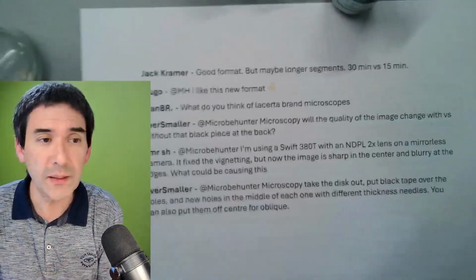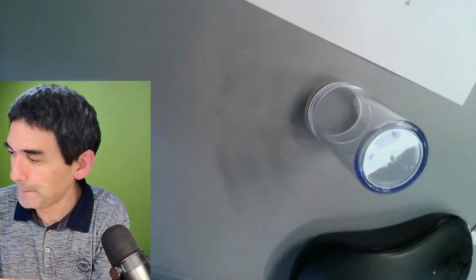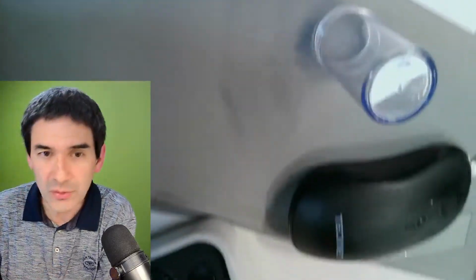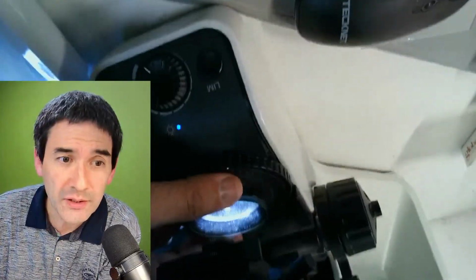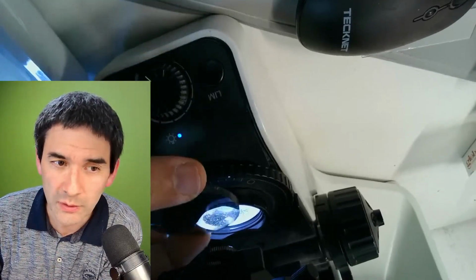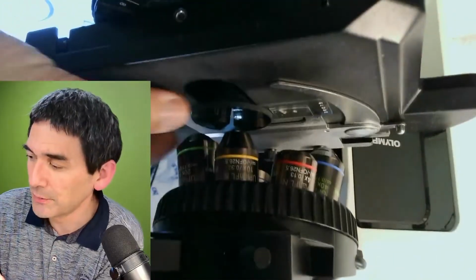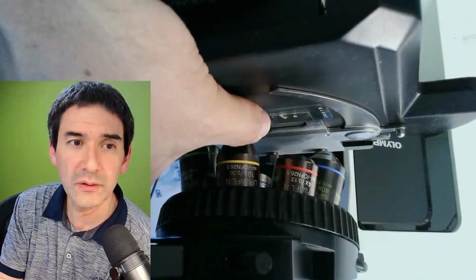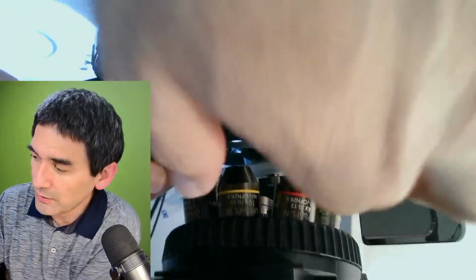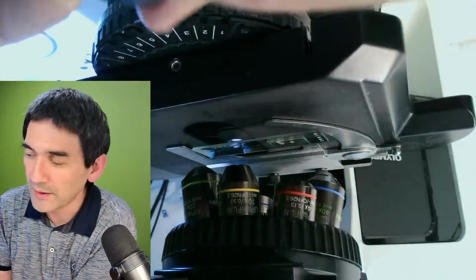So the setup looks like this, and now it's kind of upside down. So what I'm going to do is the following. Down here is the filter that I normally don't use. Up here, I also put this other filter, the second one, pretty improvised on top. It's a little bit wet now, right?